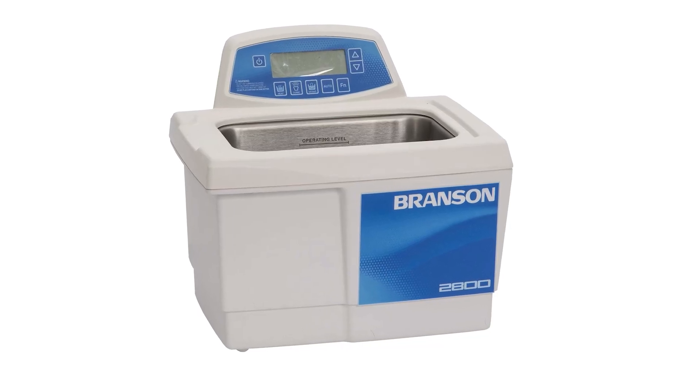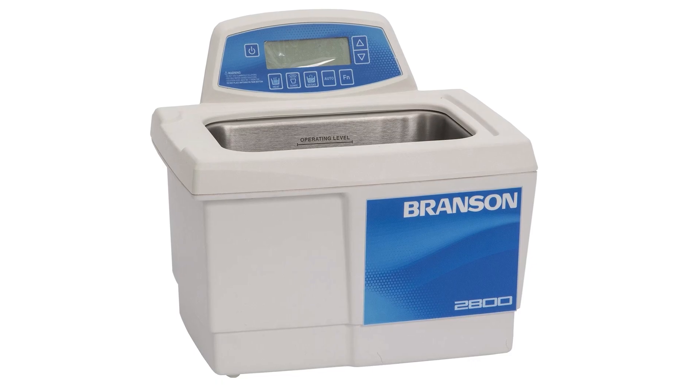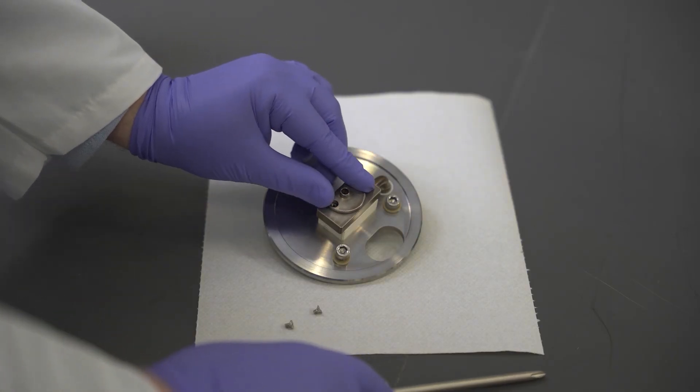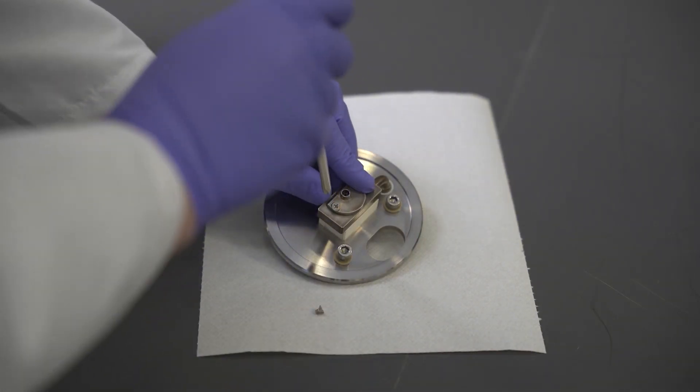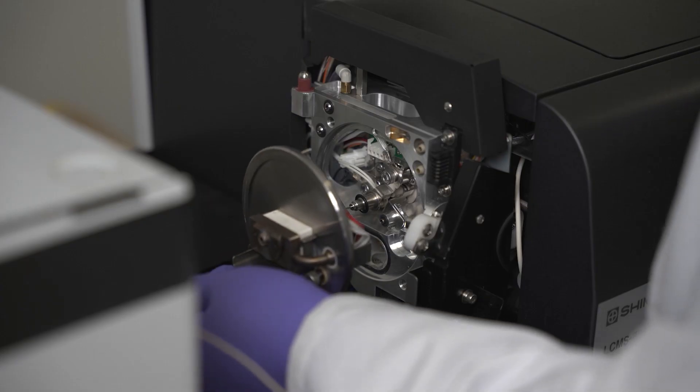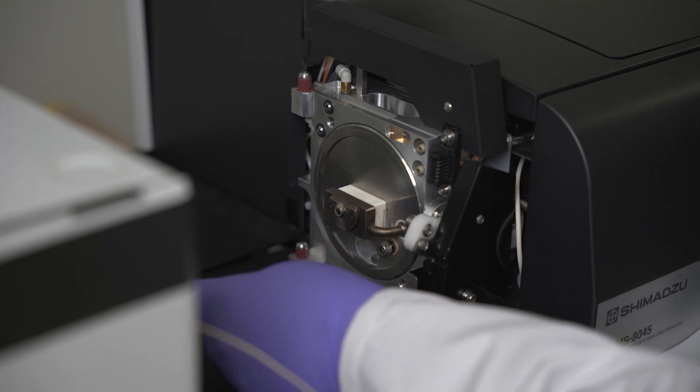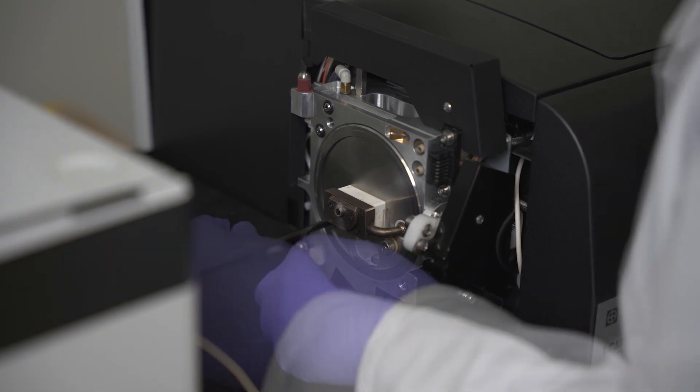The screws and sampling cone can be cleaned in an ultrasonic bath with methanol solution. Once dry, reassemble the cleaned sampling cone, heated block, and heater flange, and reinsert them into the instrument. Retighten the bolts with the Allen wrench so that they are snug, but do not over tighten them.